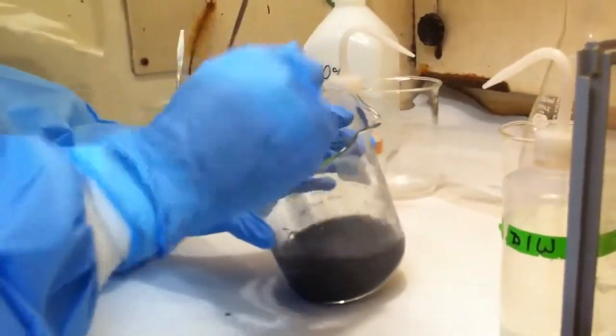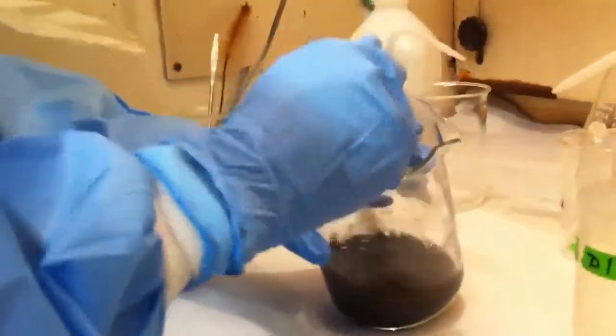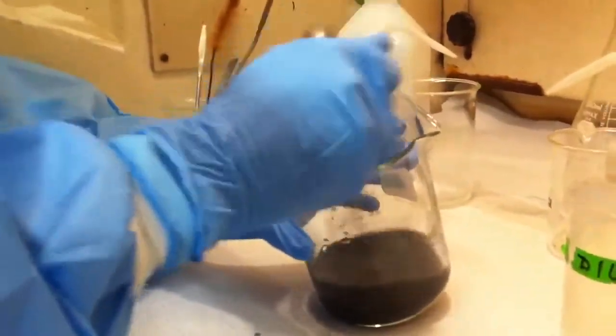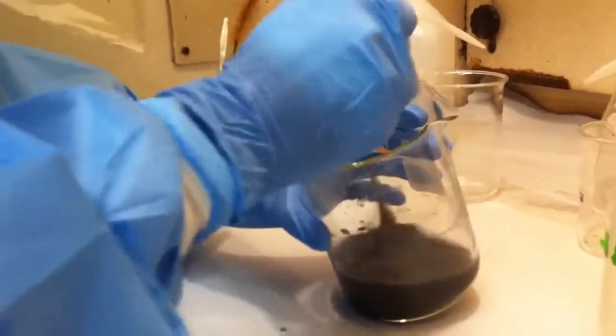The more acid that's added, the quicker it turns into a big blob. So the slower you need to add it, the more chopping that needs to happen.